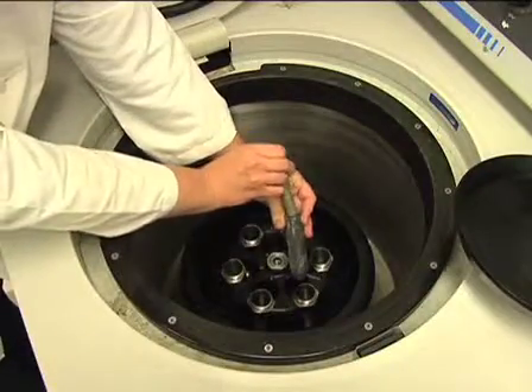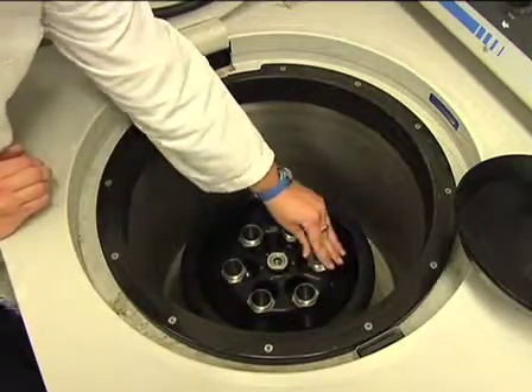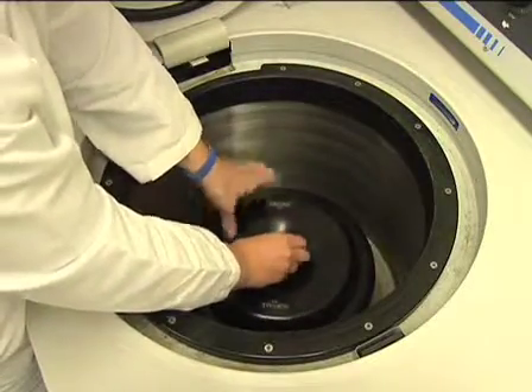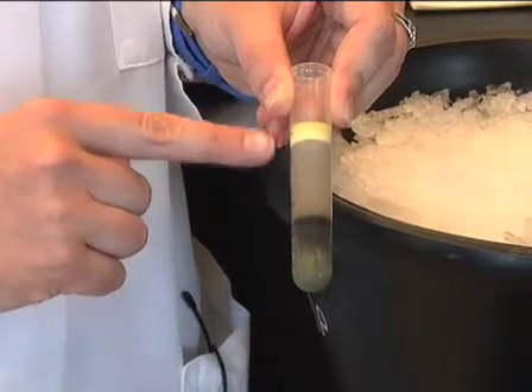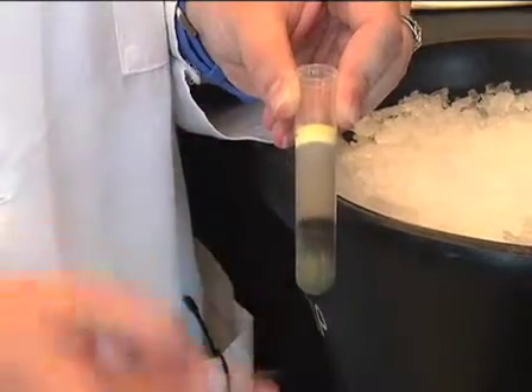Now lyse the eggs by centrifuging for 15 minutes at 12,000 g in a Sorval HB4 swinging bucket rotor at 4 degrees Celsius. The lysed eggs will be separated into three layers: a yellow lipid layer on top, the crude extract in the middle, and a dark pellet at the bottom.